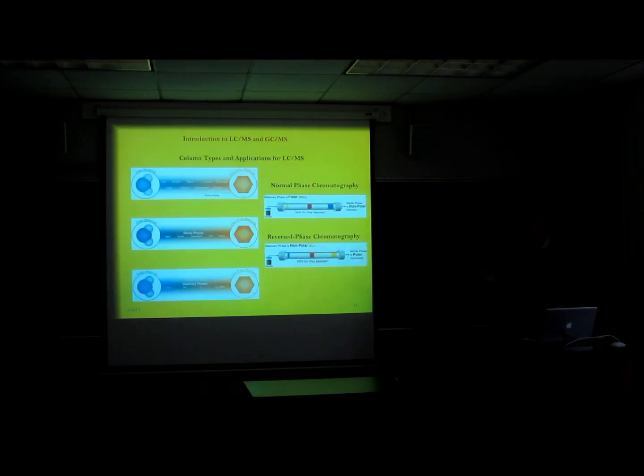98% of every LCMS separation you'll see out in the literature is going to be water, reverse phase chromatography with a gradient from high water to high acetonitrile containing 0.1% formic acid. And that'll be most of the separations you're going to see when using mass spectrometry. And people will sacrifice chromatographic performance because they have this high dimensionality separation based on unique mass using the mass spec.